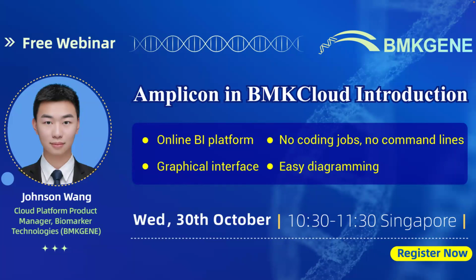Secondly, key results from Amplicon sequencing, a deep dive into the main findings and insights generated with BMKCloud's Amplicon analysis workflows. And thirdly, customizable data visualization and mining. Learn how to personalize visualization outputs and conduct your own in-depth data mining to meet specific research needs.